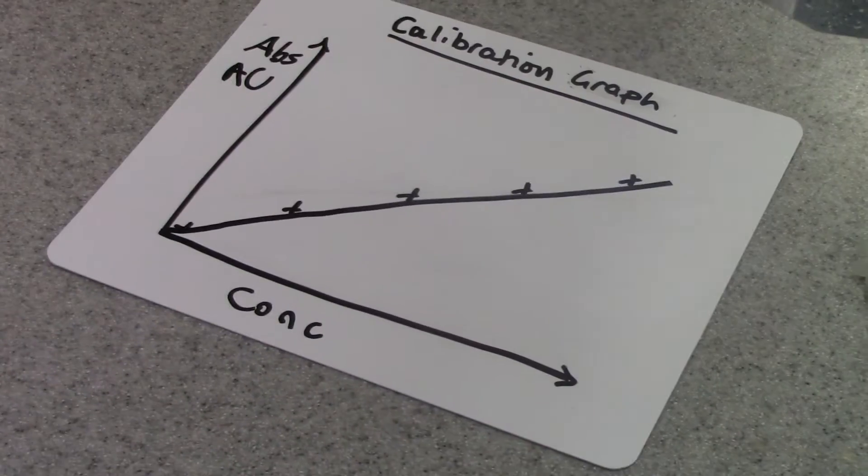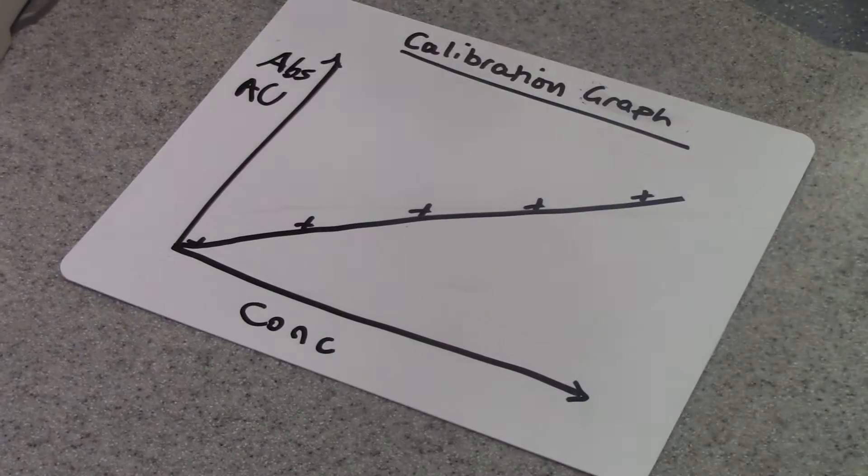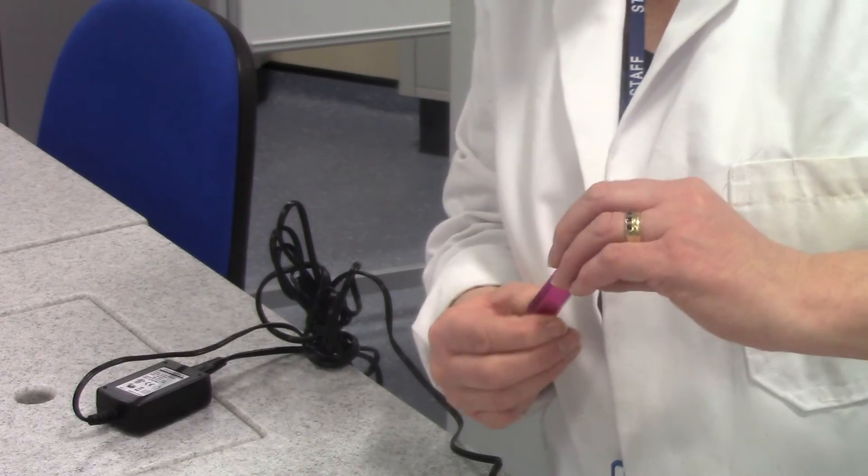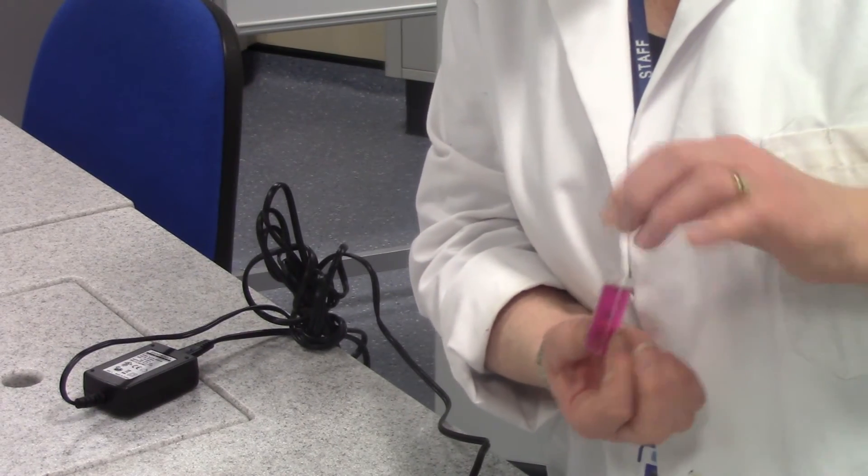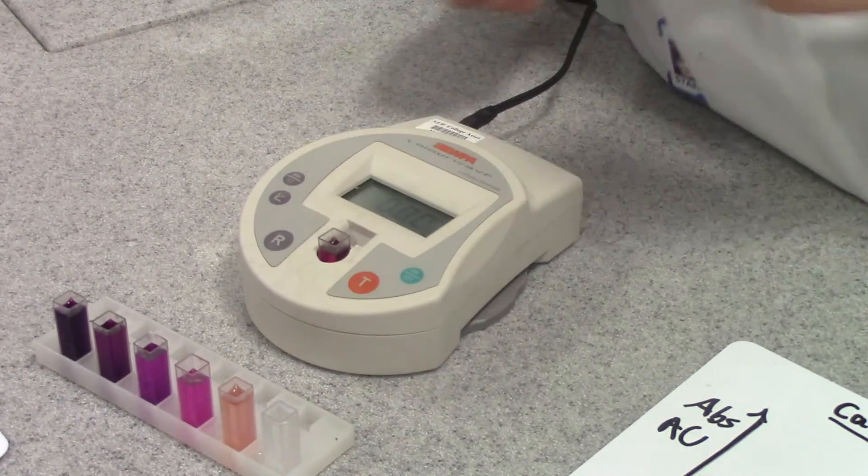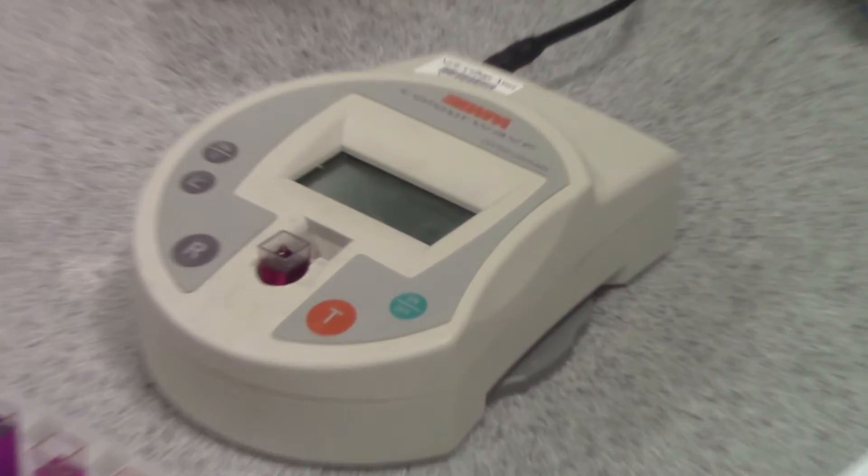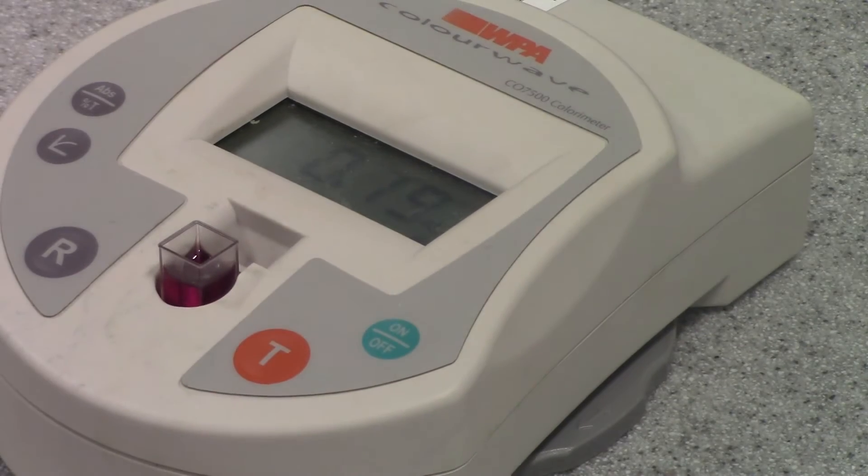I'm now ready to determine the concentration of my unknown solution, which I have here. Checking that I don't handle it by the clear sides, I put it with the V facing away from me and I press T. And this gives me an absorbance value.